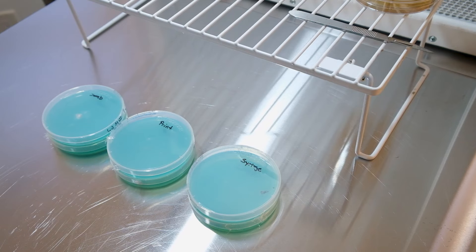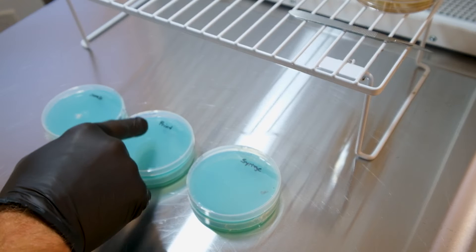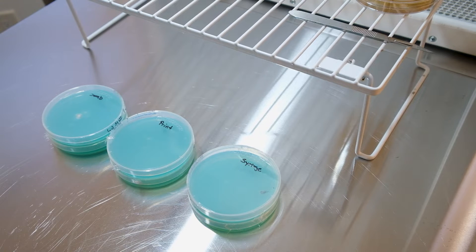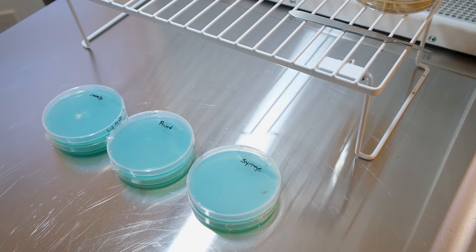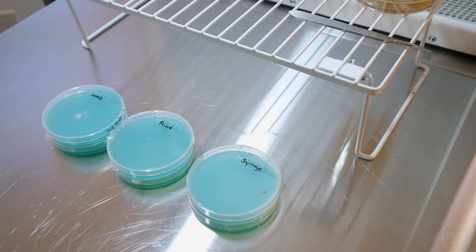Welcome back to Real Simple Mushrooms. We're doing a check-in on our spore germination plates. If you remember from our video a week ago, number seven, we did a spore syringe, a spore print, and a spore swab — two plates on each. This is my potato agar recipe; I'll put it in the comments below. It's really easy, really cheap, and works great — about 99% of everything I put on here spore-wise germinates.